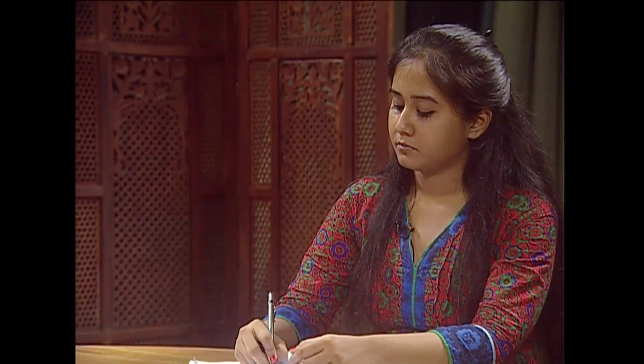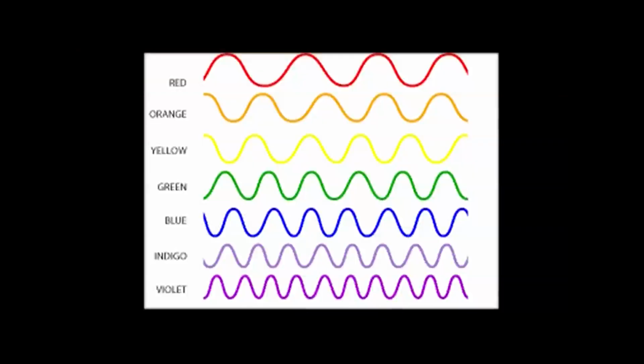The wavelength of X-rays can be a few nanometers, and that of radio waves is a few millimeters, while the visible spectrum, which is the spectrum we can perceive, the VIBGYOR, varies from 400 to 700 nanometers. So what we see is a very small part of the whole spectrum. In light microscopy, it is this visible spectrum which is utilized.